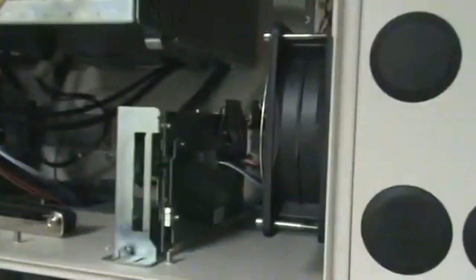Detector Personality Module. We know that we are dealing with TCDs, because these are the wires coming off of our thermistor beads. Our little thermistor beads are coming out of these guys. So the thermistor beads come up to here to our Detector Personality Modules. There's one for that side, there's one for that side. That goes down into here.